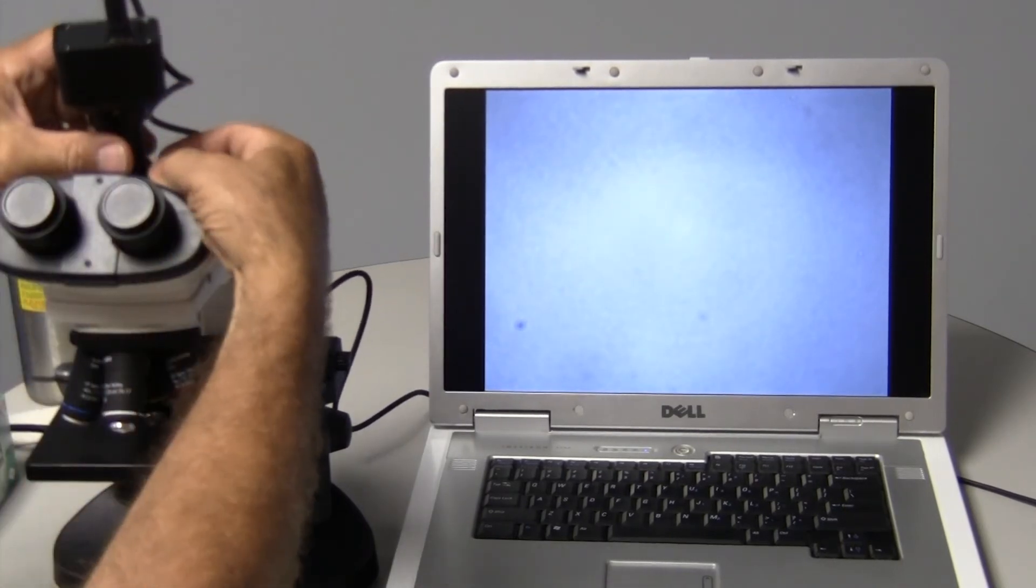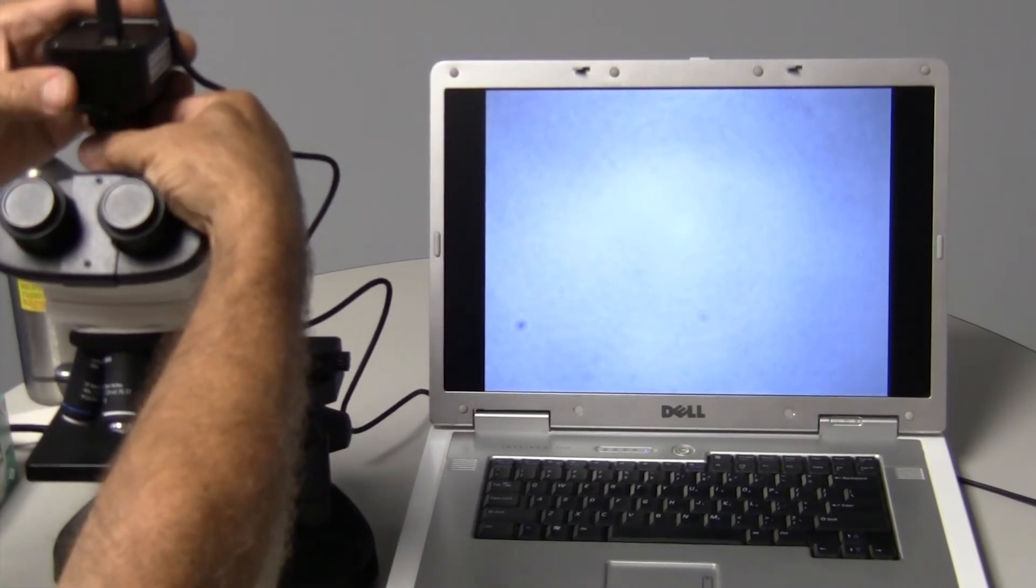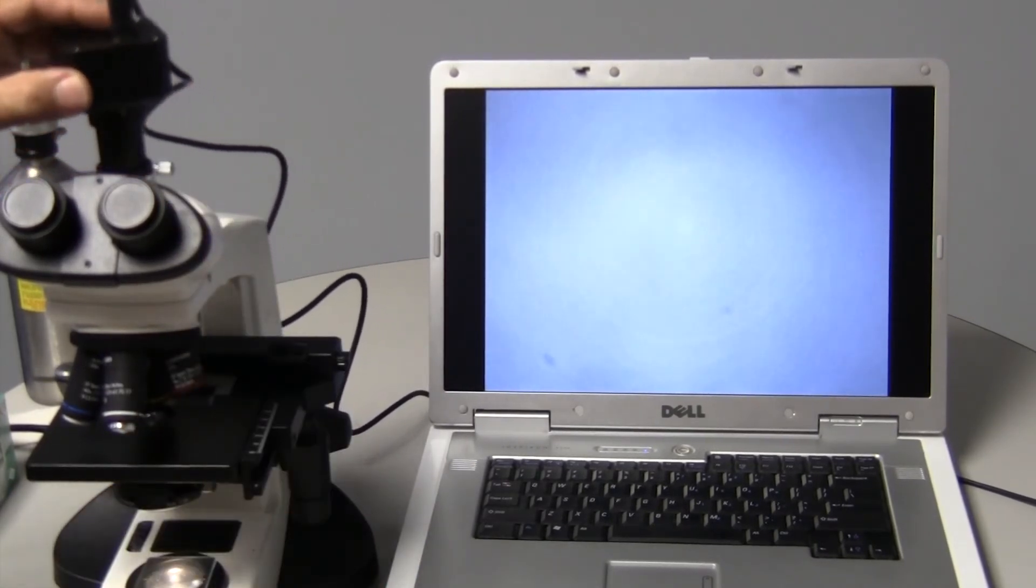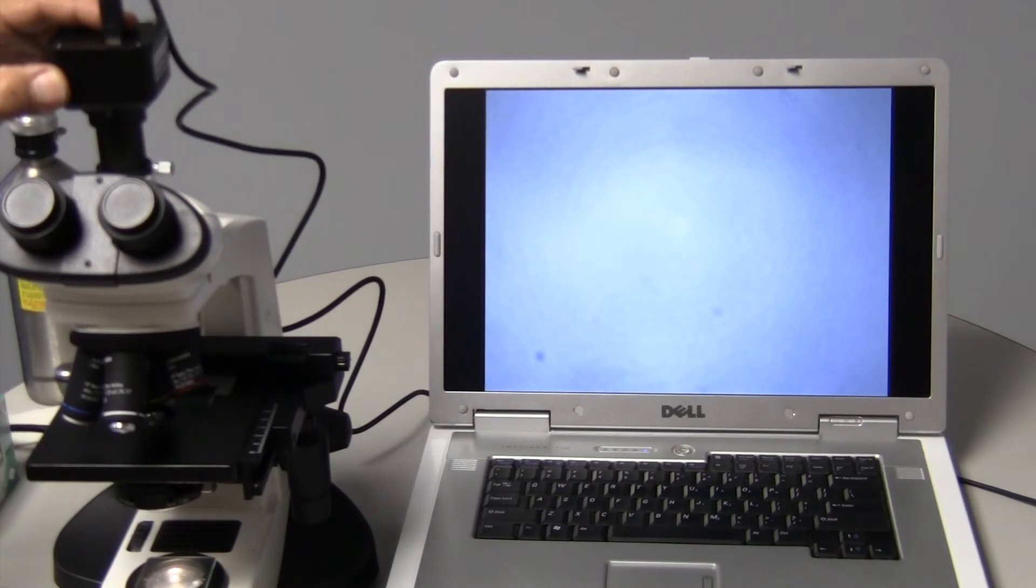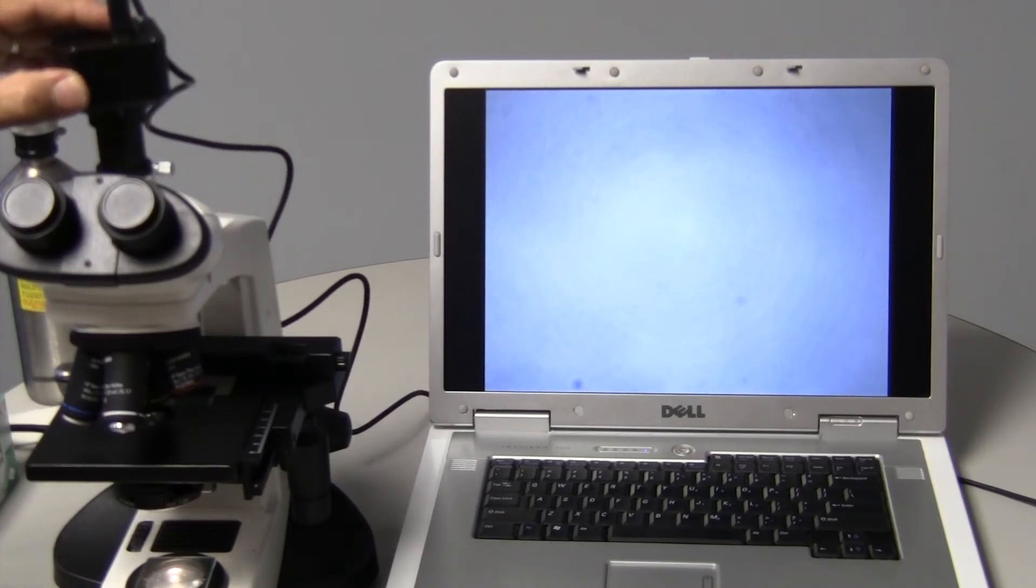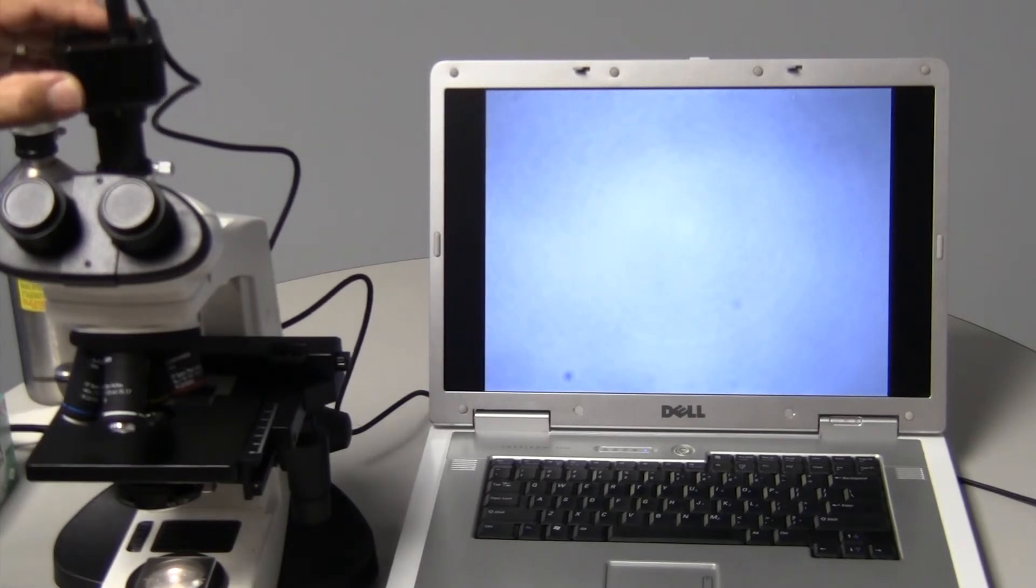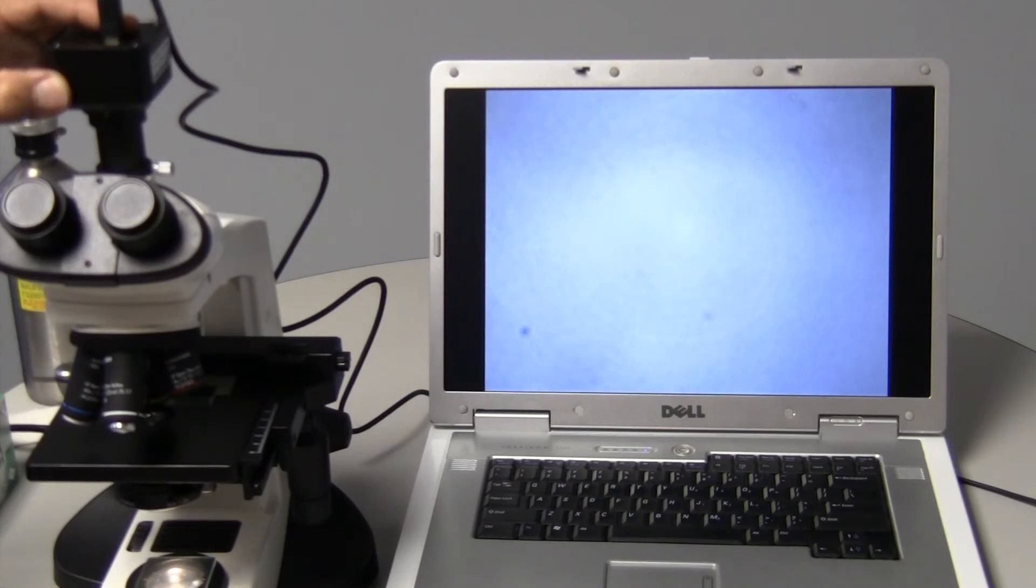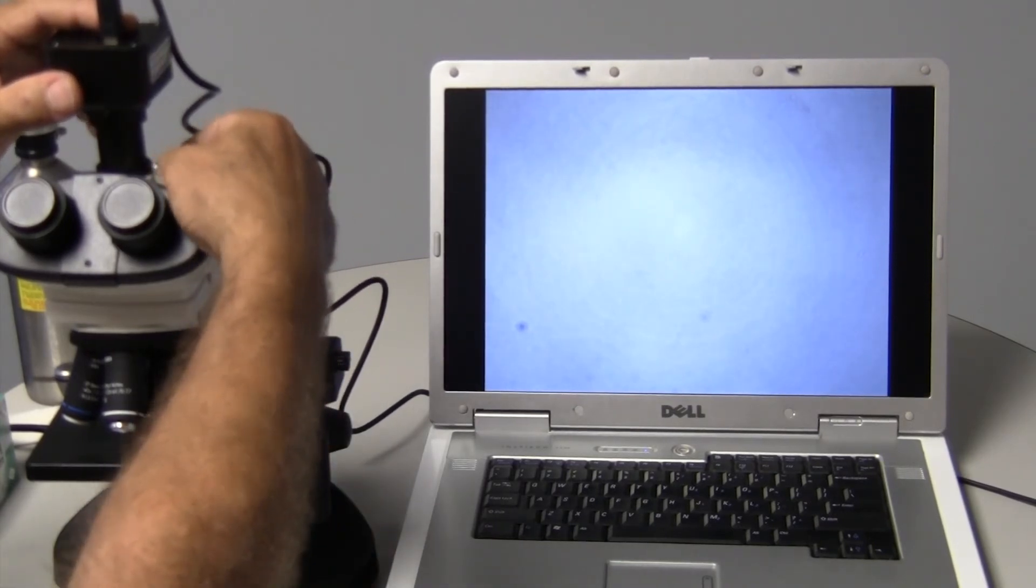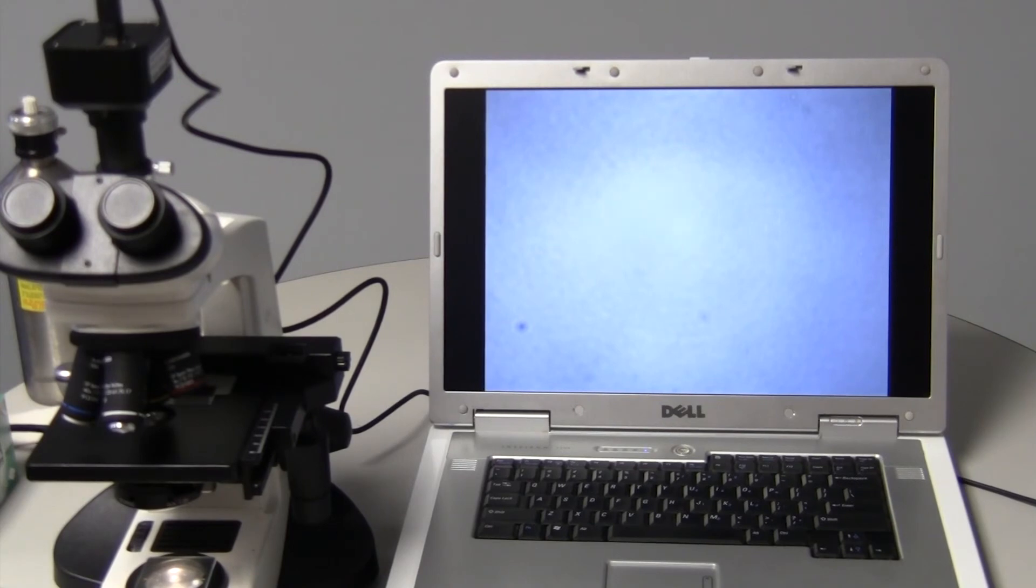And now I'm going to secure the intermediate lens and only turn the camera. And you can see there is still a couple pieces of dirt attached to the camera lens, which will still need to be removed. But I wanted you to know that it's very difficult to get every possible piece of dirt off of the lens when you're in the field. Because as soon as you clean it, something will fall on between the time you get it clean and back on the microscope. But this is obviously a significant improvement over where it was.